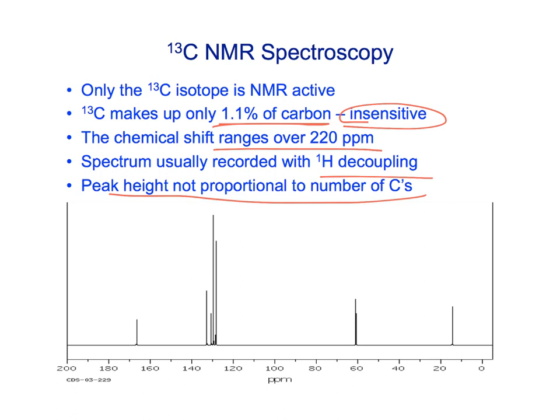Okay? There are a couple of things that we can get from this, though. Usually the quaternary carbons, so the carbons that have no hydrogens attached, are usually small. Okay, so quaternary carbons are small. And the other thing is if we have similar types of carbons, whether they're, say, carbons in benzene rings or carbons that are just CH3 and CH2s, oftentimes if we have one that's worth 2 carbons and one that's worth 1, they will be roughly 2 to 1 in ratio, but you can't always count on that, all right?